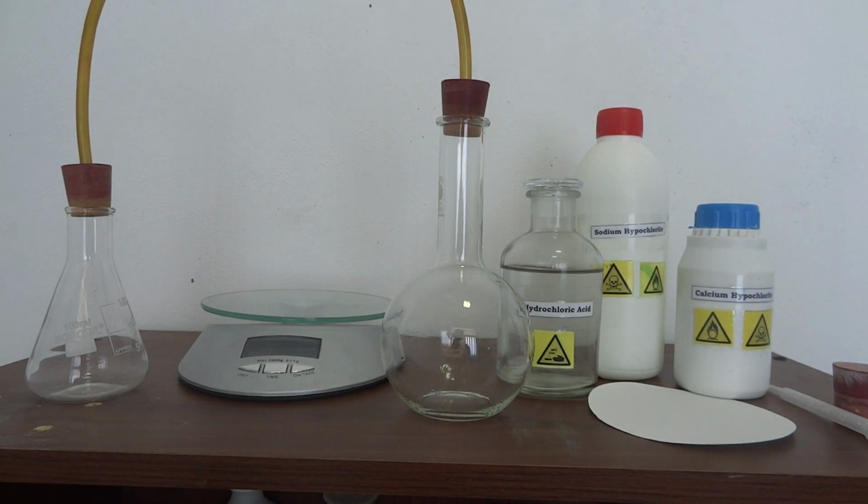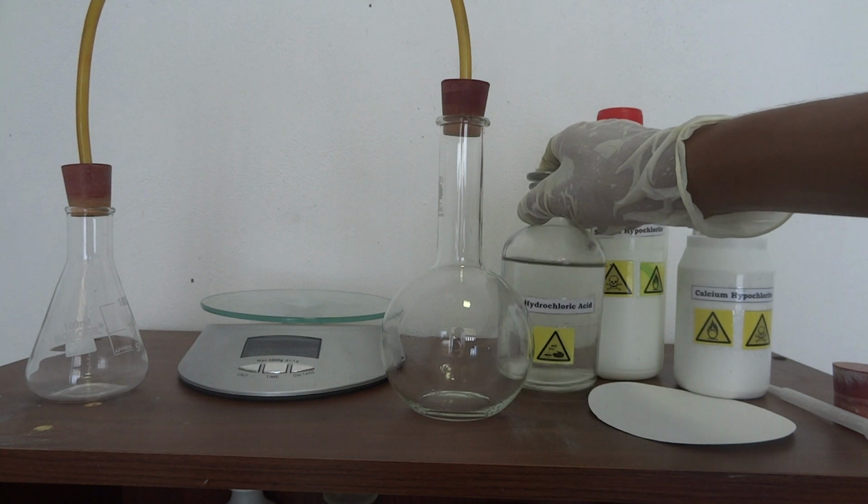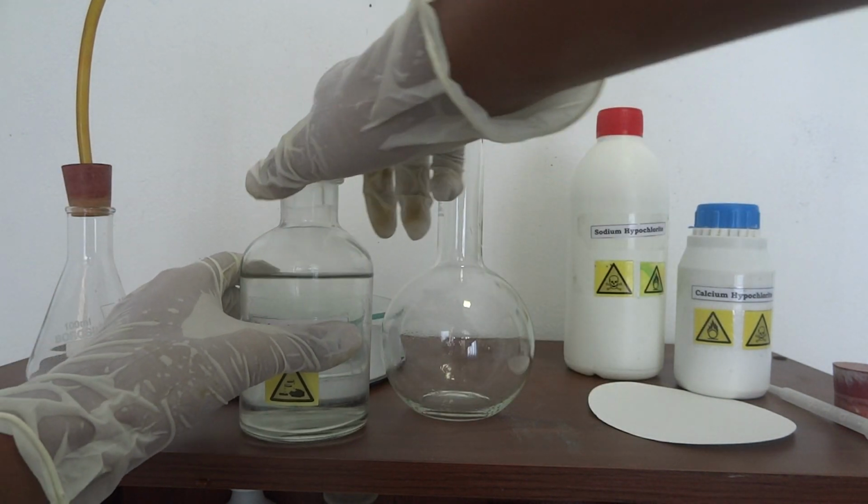Okay, so enough talking, now let's do the experiment. First, we should take some hydrochloric acid.